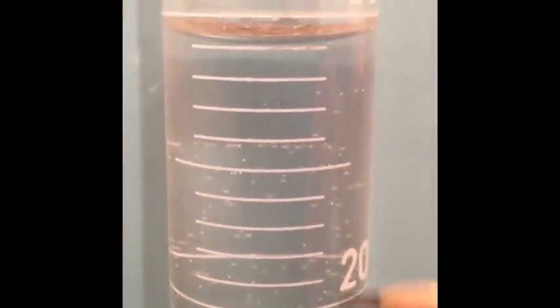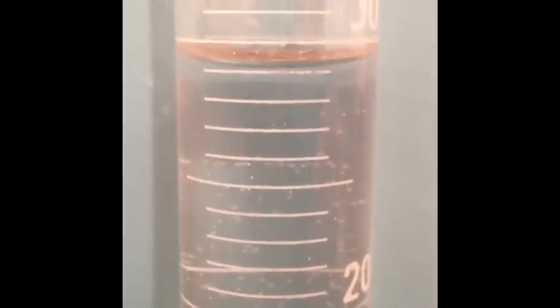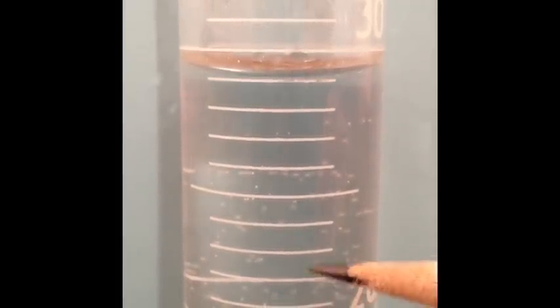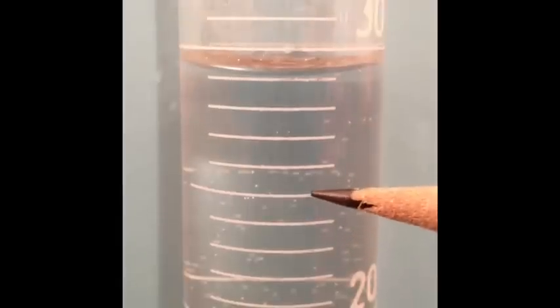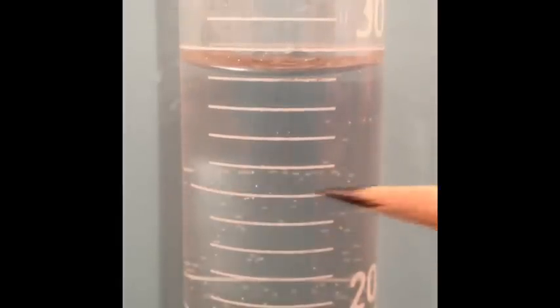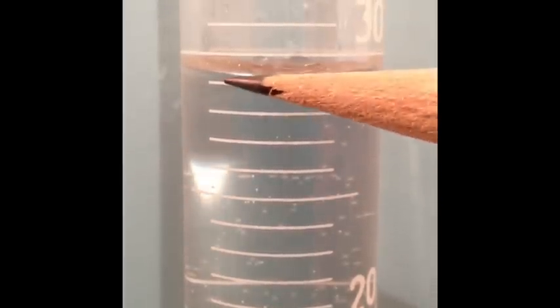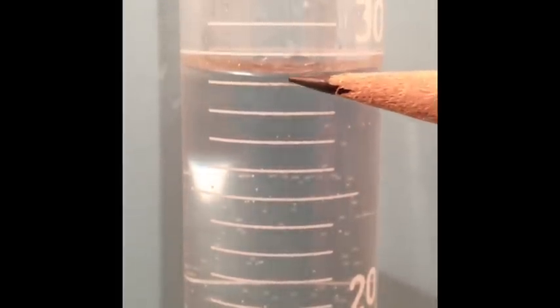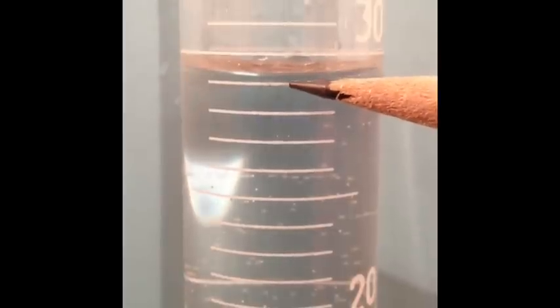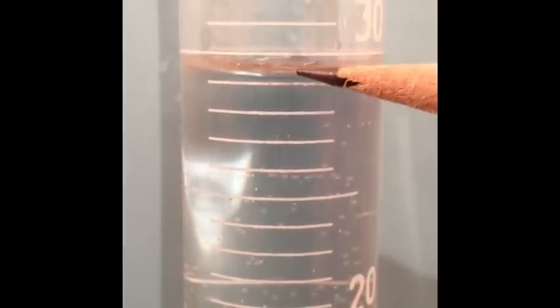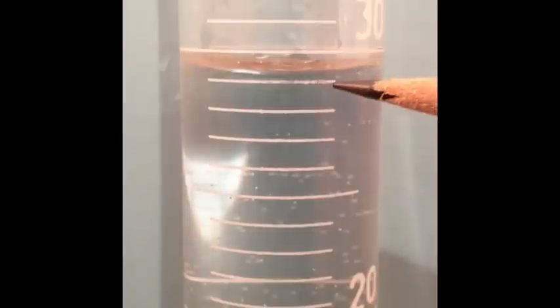So if we measure that, you can see that this line is 20, and it goes all the way around the graduated cylinder. The next line is 21, 22, 23, 24, 25, and you'll see that line's a little bit longer. 26, 27, 28, 29 is where the bottom of that curve is. Now, there is a little bit of space between the 29 line and the end of the curve, so we could say 29.1 if we wanted to divide this into 10 pieces to be as accurate as we can.